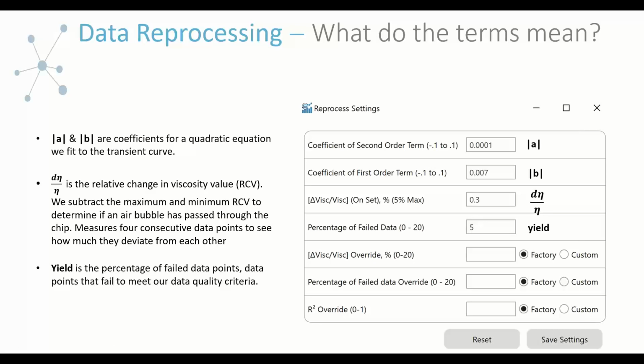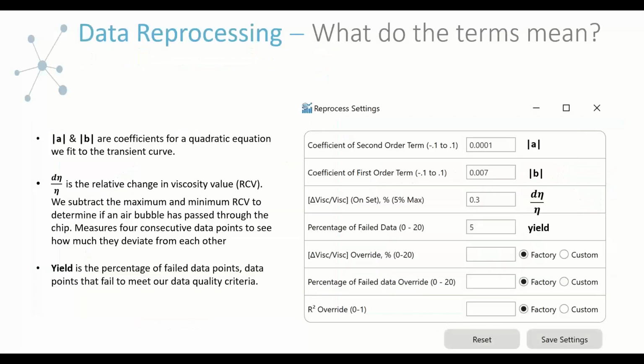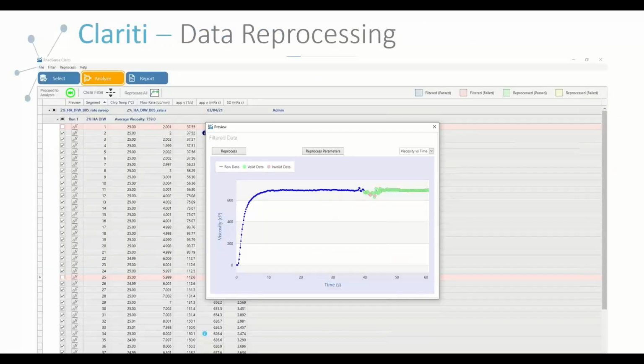Then here, I'm just going to show two examples of qualified versus unqualified data. So here, I did reprocessing. You can tell because this window is green or blue. We go back again a couple slides. This is a purple color, so I hadn't clicked reprocess yet.